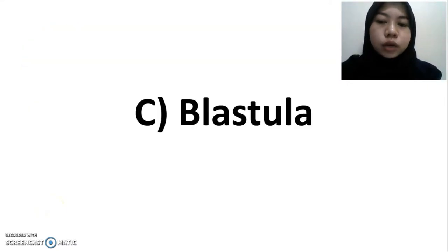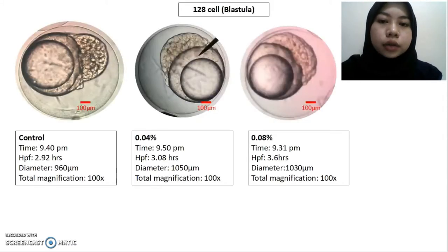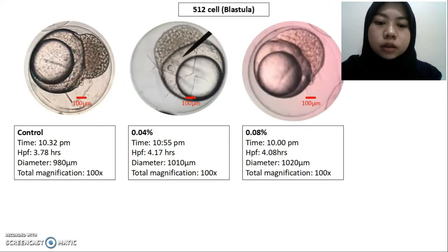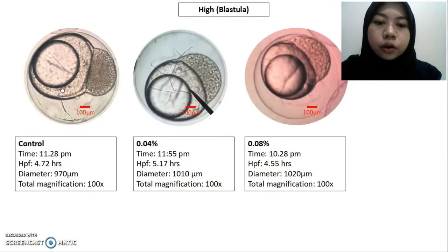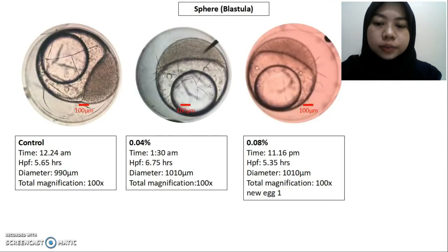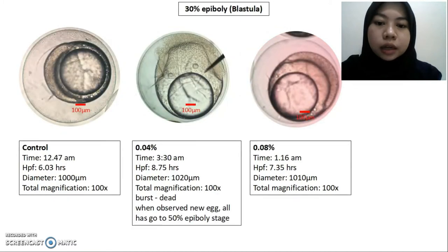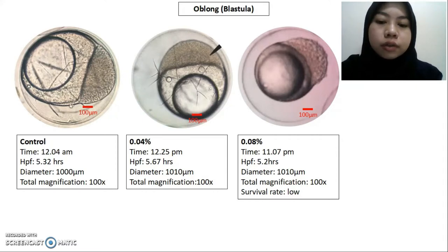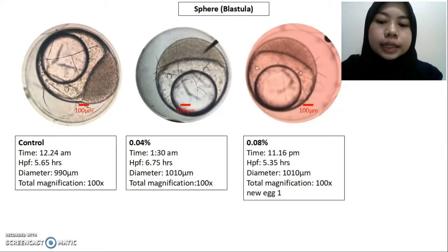For the blastula period, we start with 128 cells, 256 cells, 512 cells, 1000 cells, high, oblong, sphere, dome, and 30% epiboly stages. At the oblong stage, the egg with 0.08% treatment shows a low survival rate. At the next stage, the 0.08% treatment eggs burst and were replaced with new eggs for further observation. For the dome stage control, the picture was taken from another group due to human error. At 30% epiboly, the eggs in treatment 0.04% were burst and dead.